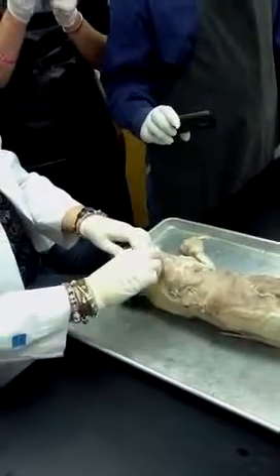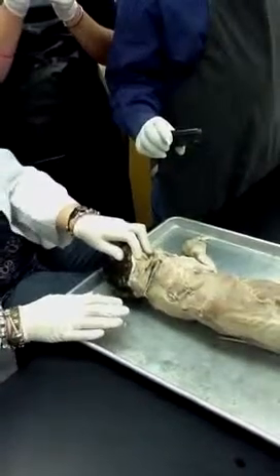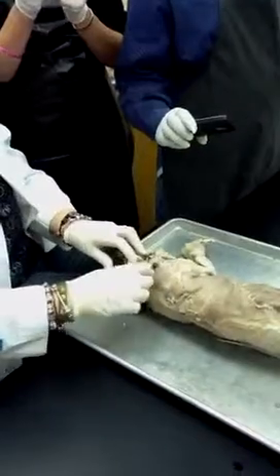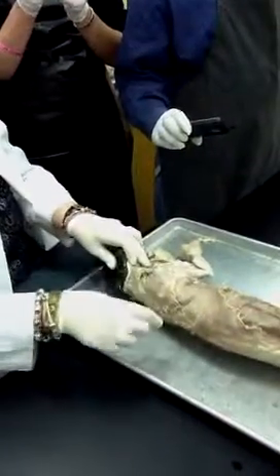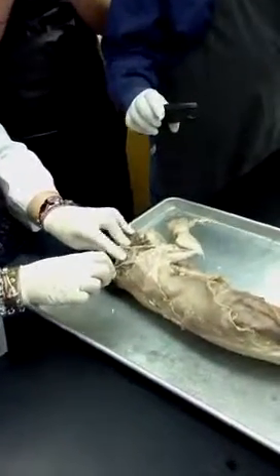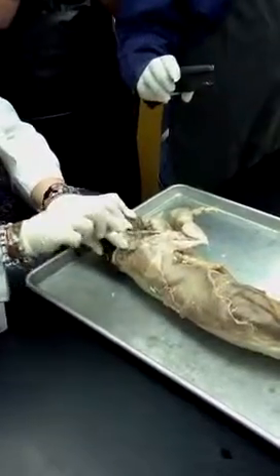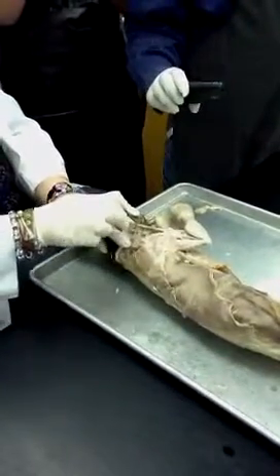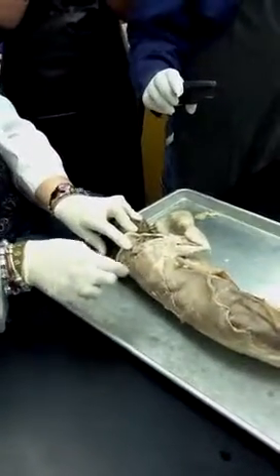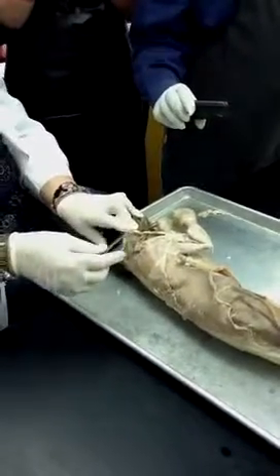This muscle right here is the levator scapulae ventralis. It elevates your scapula. On this side of the levator, it would be the deltoids. This is the spinodeltoid right here, the acromiodeltoid, and the clavodeltoid. So humans have just one deltoid and one trapezius, but cats have 3 heads. They have basically 3 parts of the trapezius and 3 parts of the deltoid.